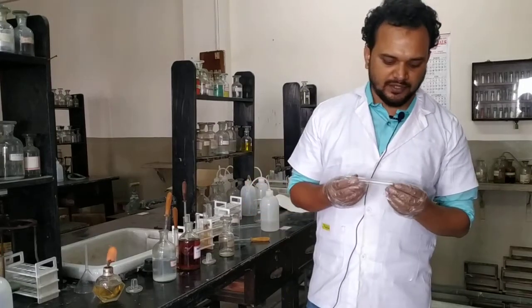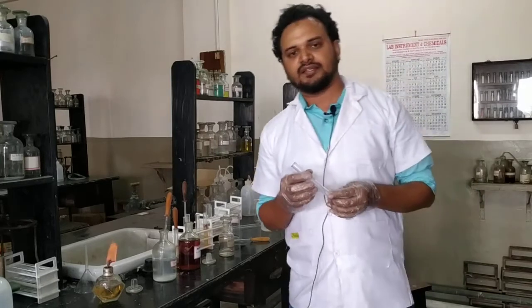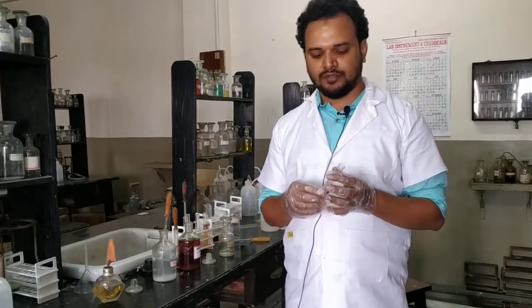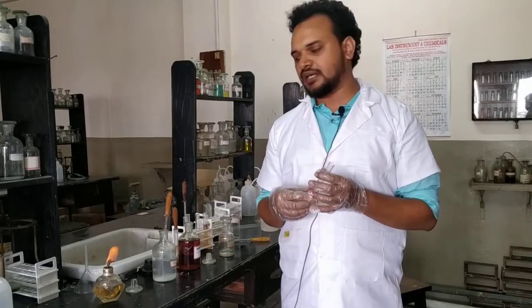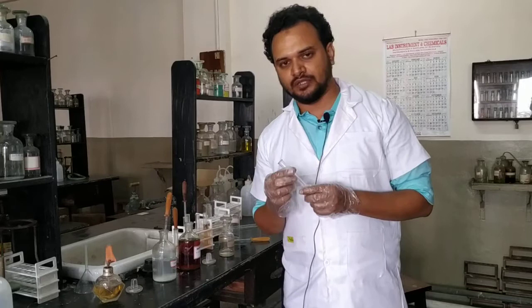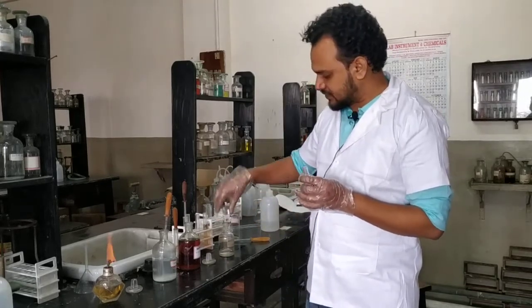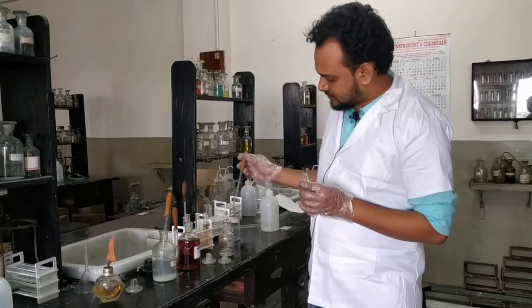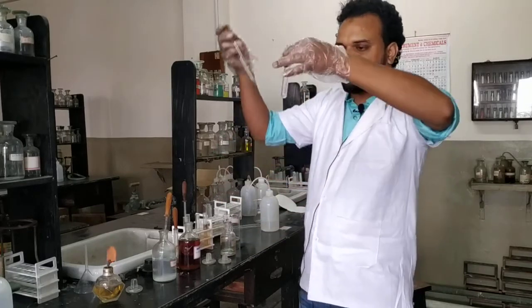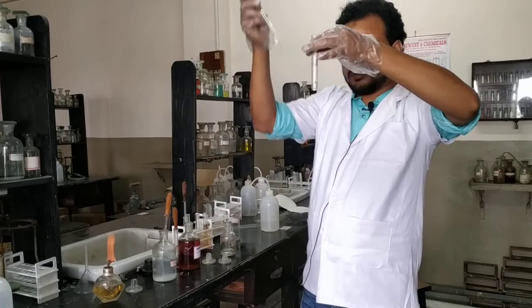In this organic compound sample testing practical work, our next compound is acetone. We already did formaldehyde with four tests, and now we are coming to acetone. The first test is with nitroprusside solution. We will take about 1 ml of acetone in a clean test tube.